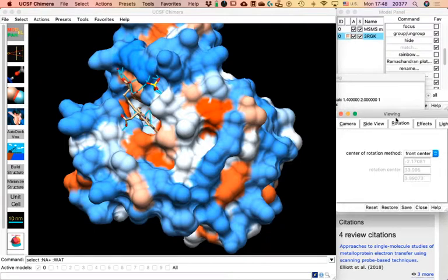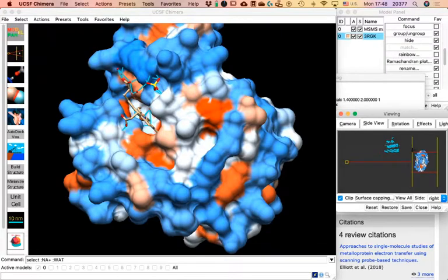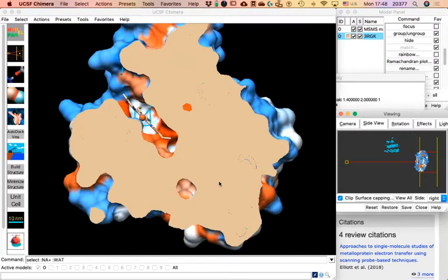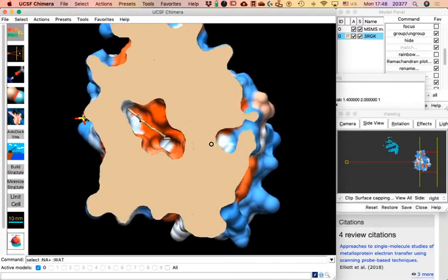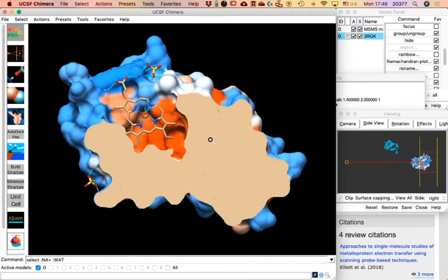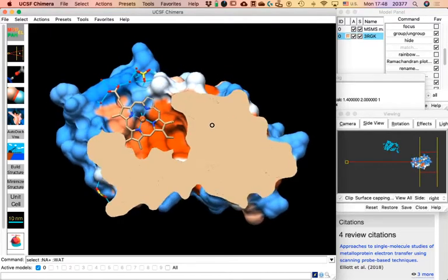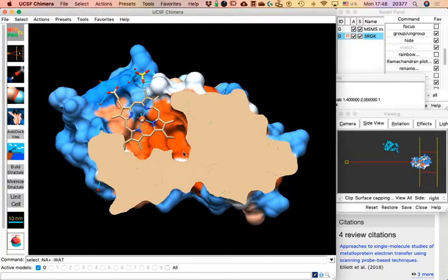Remember the Side View control. Now that we have this view, do you see these yellow lines? Click on the one on the left and drag it so that it cuts the protein in half. Now we are able to look inside the protein as if we were slicing it, and we can look at the cavity where the heme group is located — all just by moving these yellow lines.